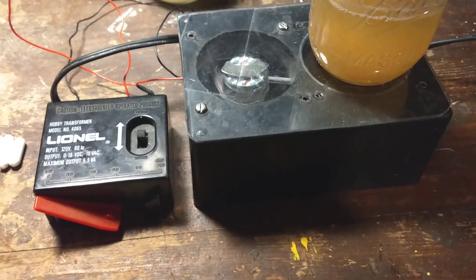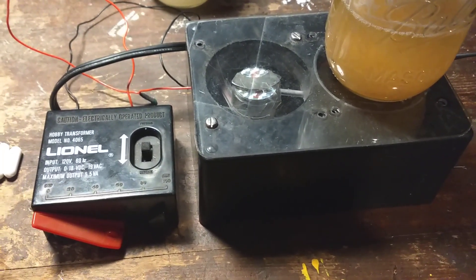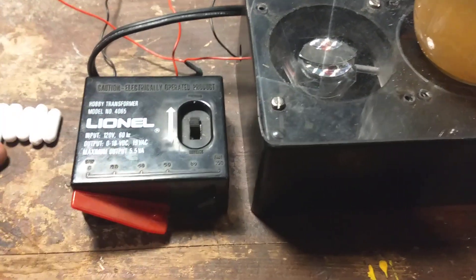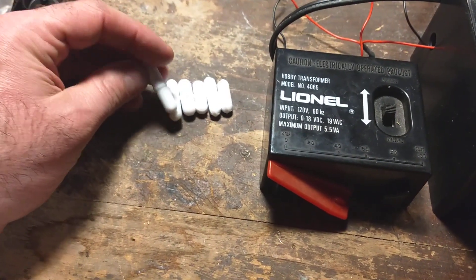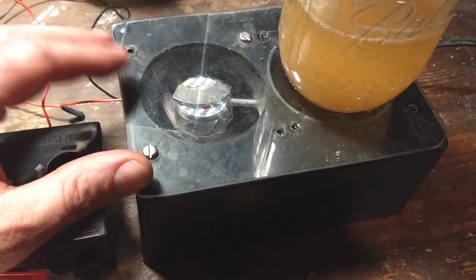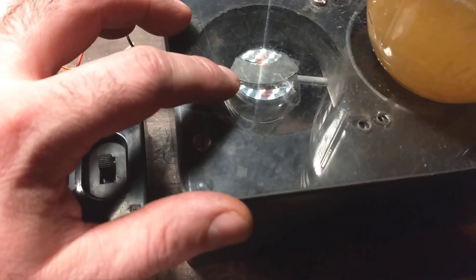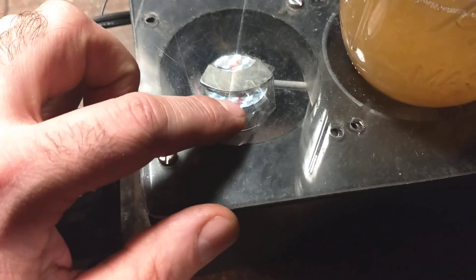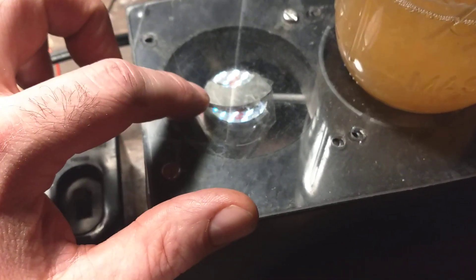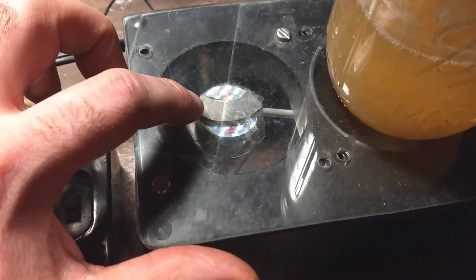I just wanted to take a minute to show everybody this little do-it-yourself mixing stirrer thing for my liquid culture. I got this Hobby Transformer from Lionel, some magnetic stirrers from eBay, and then this is a project box — just a plastic box, you used to be able to get it at Radio Shack. Inside there is a computer fan, and I cut all the blades off the computer fan and glued the magnet from the hard drive to it.